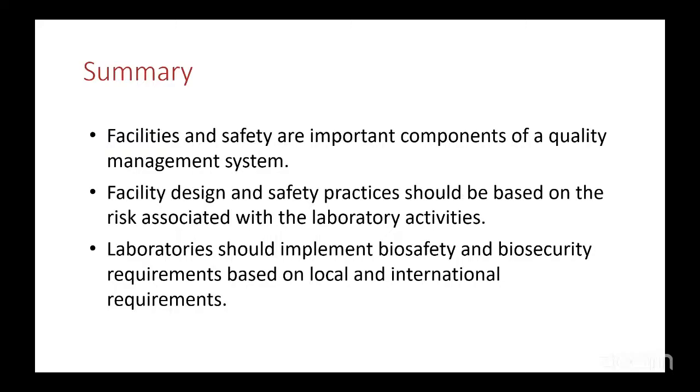Facility and safety are important components of a quality management system. Facility design and safety practice should be based on risks associated with the laboratory activities. Laboratories should implement safety and biosecurity requirements based on local and international requirements.